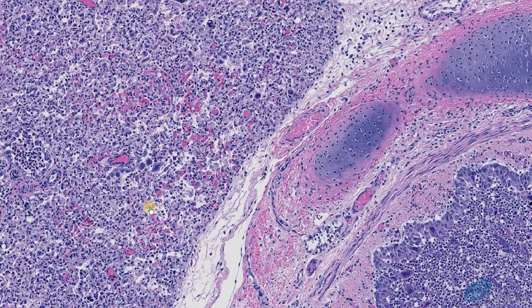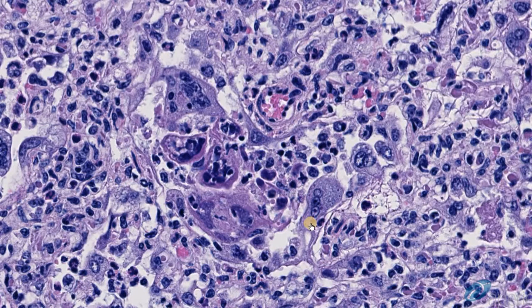Now, the alveolar architecture is similarly effaced by similar inflammation and necrosis with hemorrhage, fibrin deposits, and edema, as well as the formation of multinucleated syncytial cells, as we can see in these three examples here. Some of which contain intracytoplasmic eosinophilic inclusion bodies, as in these examples here.